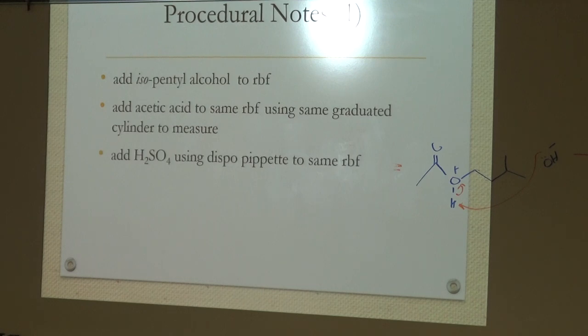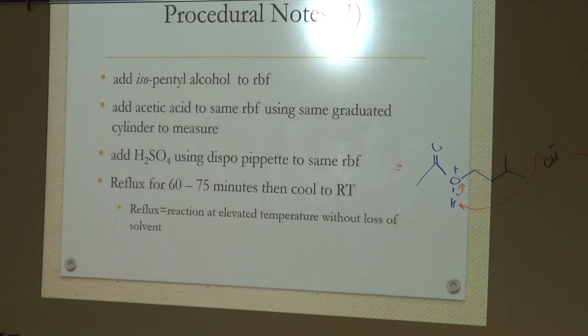Sulfuric acid. Then reflux it for an hour or so and cool it to room temperature. We've already refluxed, so that's not such a big deal.